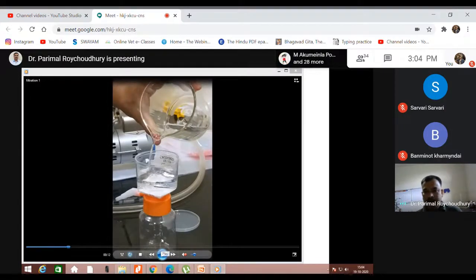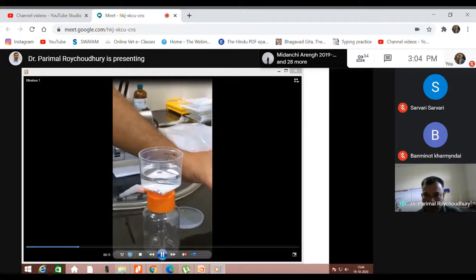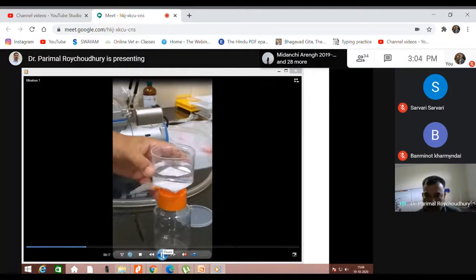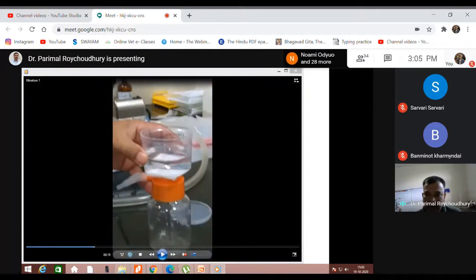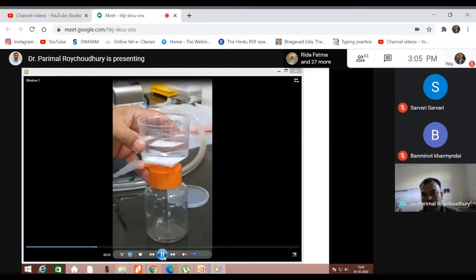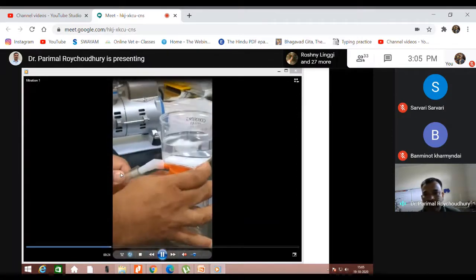Then the lower chamber must be sterile. Remember, these are ready-made filtration assemblies. If you just wait, then what will happen? The media will not get filtered. It will take a long time, drop by drop, the filtration will occur, and you have to wait for a longer duration. So to assist it, all the membrane filter assemblies are attached with a side nose, which can be fitted to a vacuum pump.